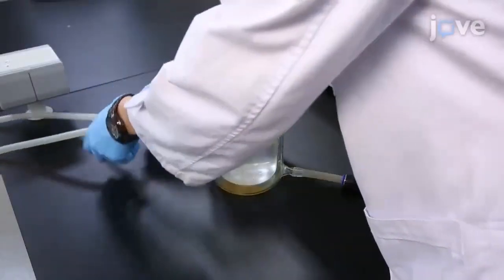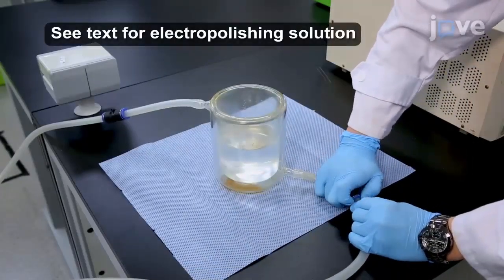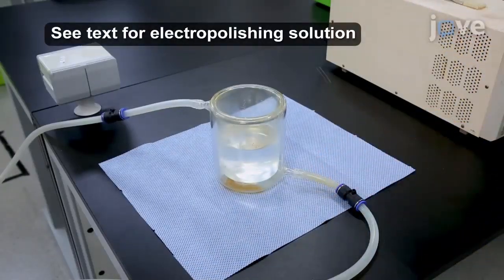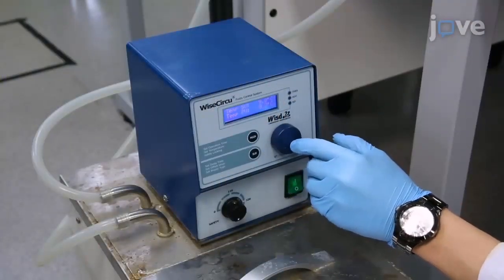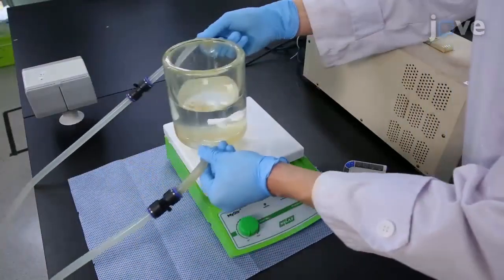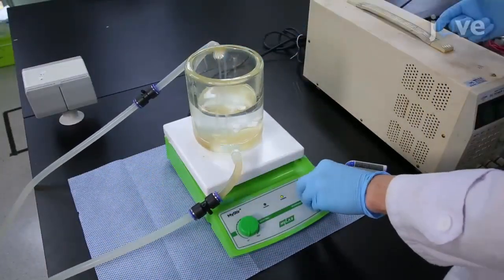To begin, connect a double jacket beaker containing the electropolishing solution to a circulator and set the temperature at 7 degrees Celsius. Leave the solution under stirring for at least 30 minutes until the temperature drops to 7 degrees Celsius.